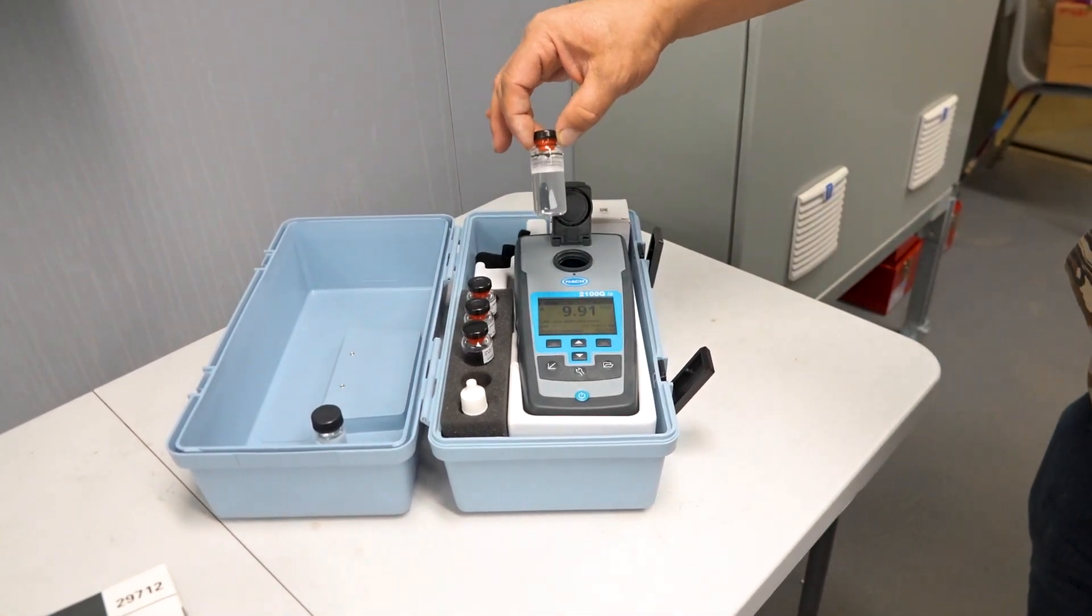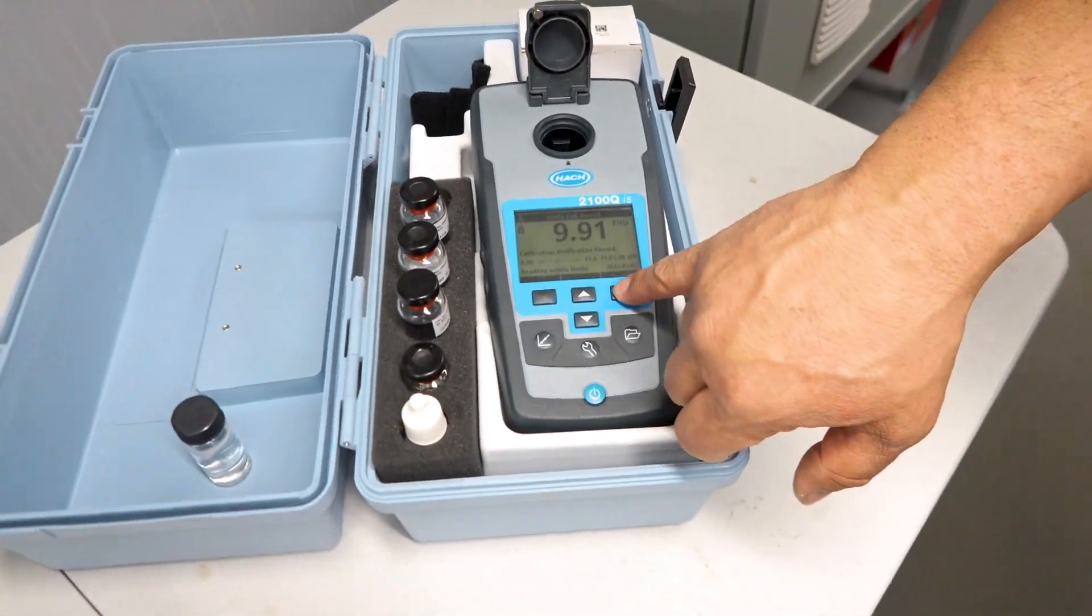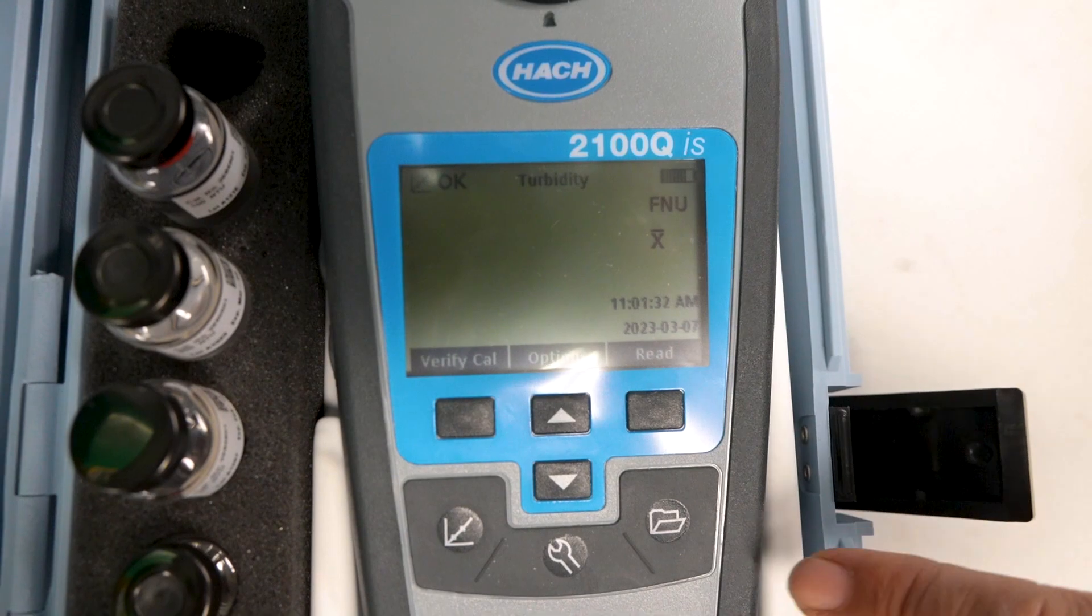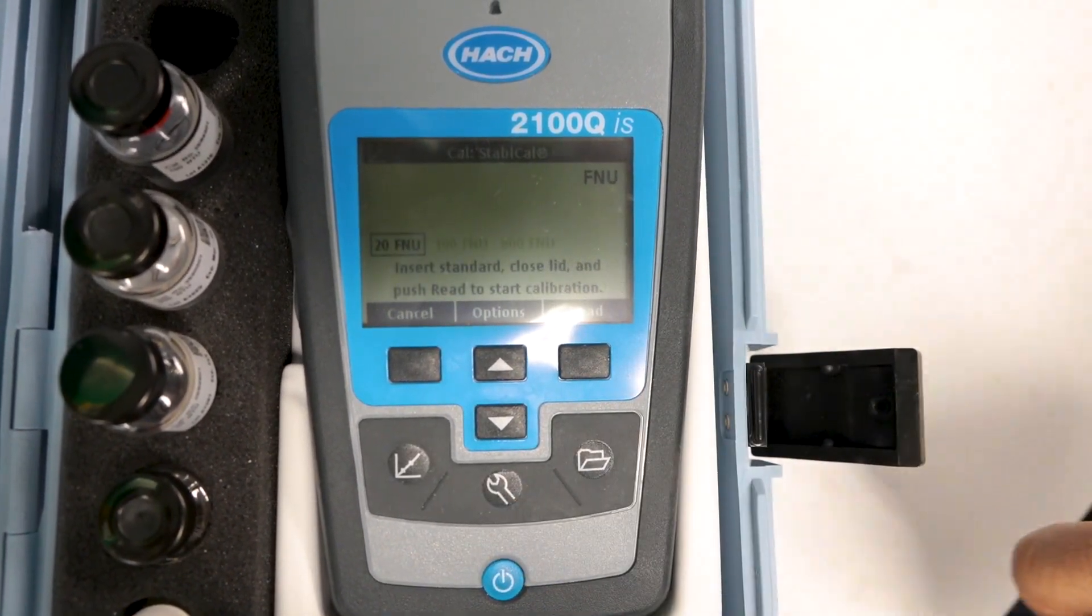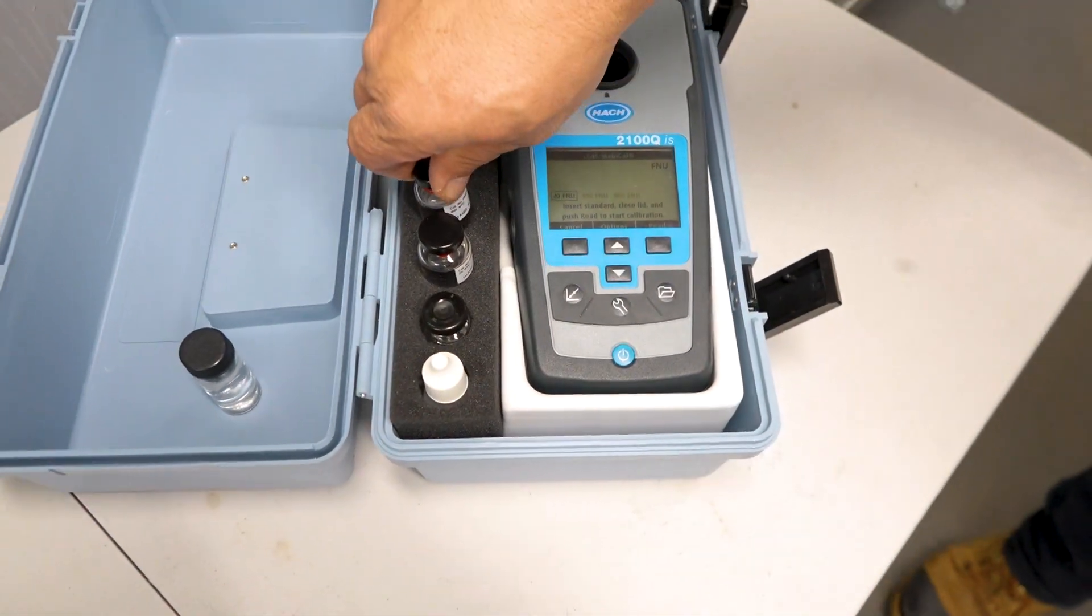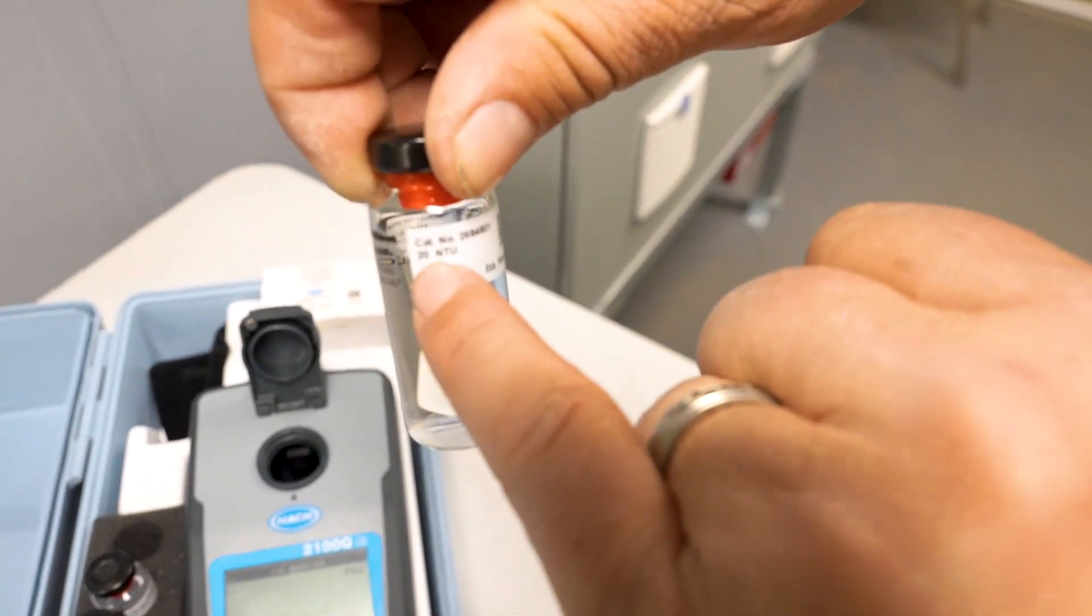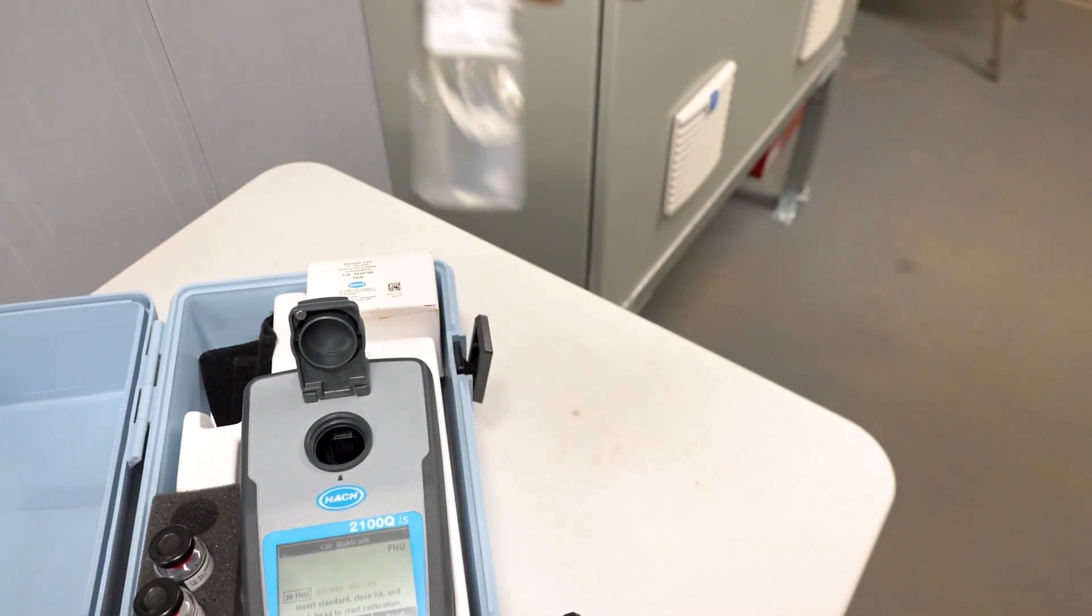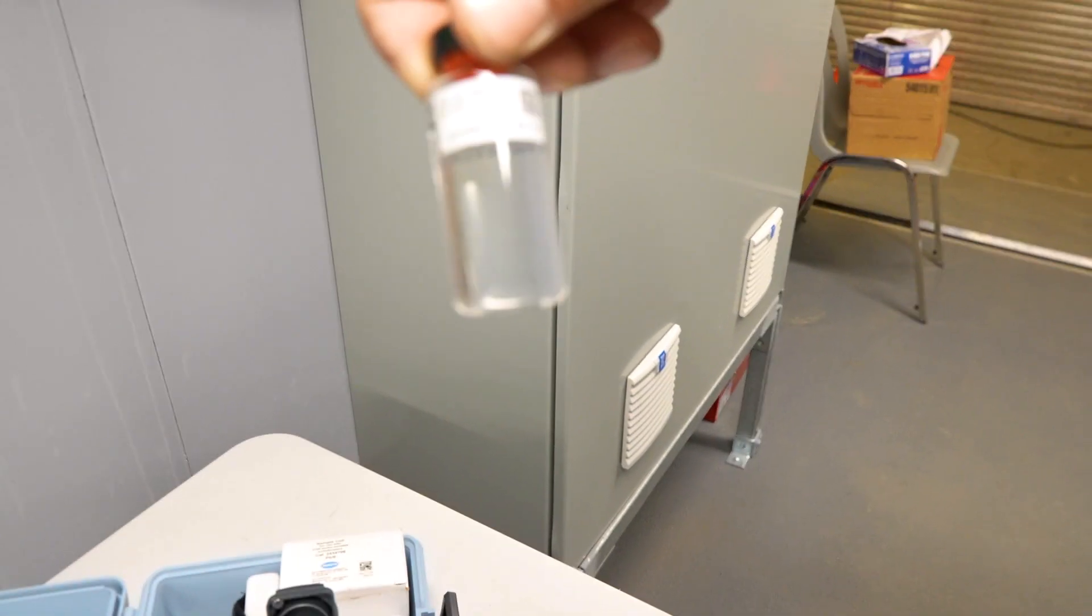So we remove the 10 NTU sample, put it back in the case, and then we hit done for the verification. Then we hit our calibration button here on the bottom left, and then it tells you to start with a 20 FNU, which is right here. It'll be 20, each bottle is labeled again, 20 NTU, and you've got to swirl it up again to get that liquid in there mixed up good, so you get the right cloudiness.